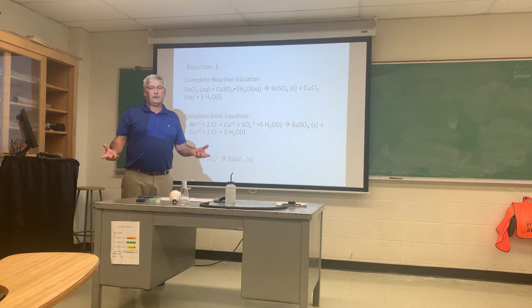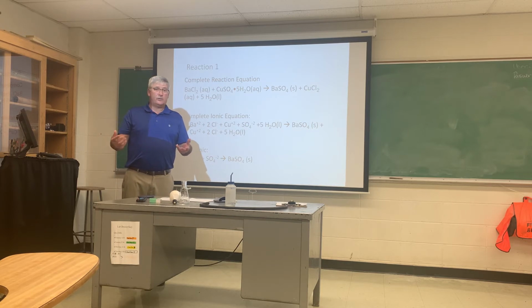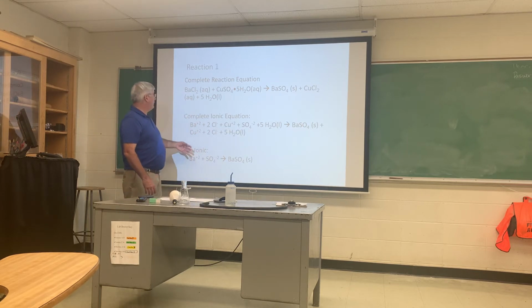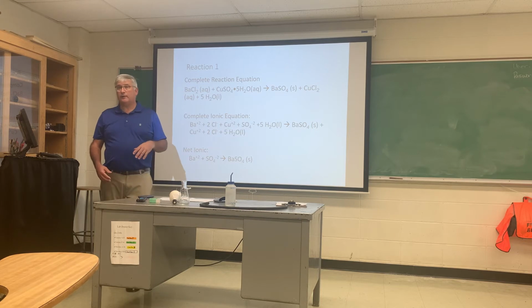Sometimes for basic things, you go to the shelf to get an ion, and you're looking for, let's say, barium nitrate, and we don't have any, and so we need a substitution, so we could actually use barium acetate. Both are soluble, and so in this case we just need barium, right? Well, here we use the barium chloride, and so any of those would work for this reaction to facilitate it.